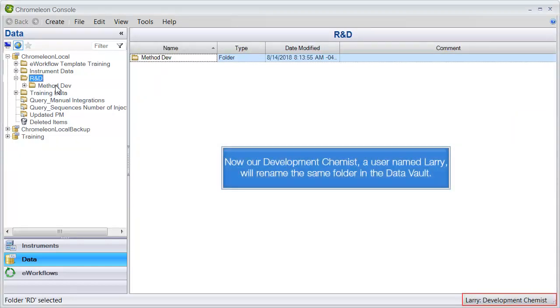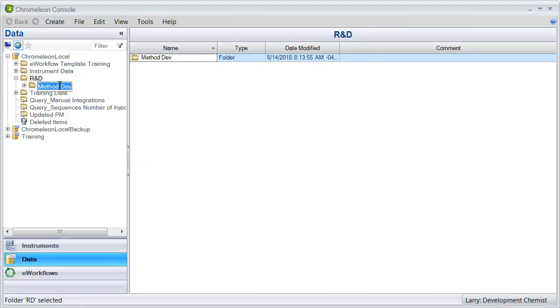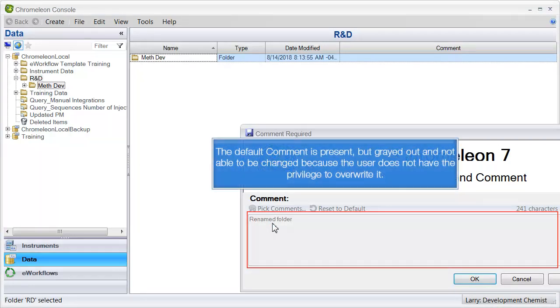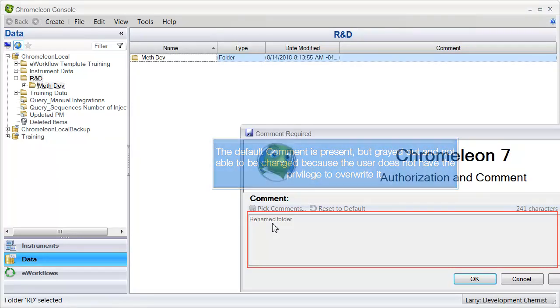Now our development chemist, a user named Larry, will rename the same folder in the data vault. The default comment is present but grayed out and not able to be changed because the user does not have the privilege to overwrite it.